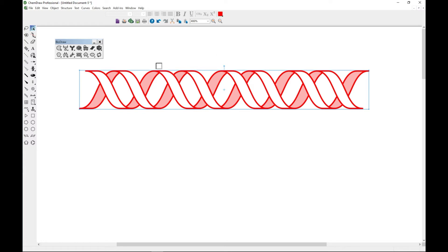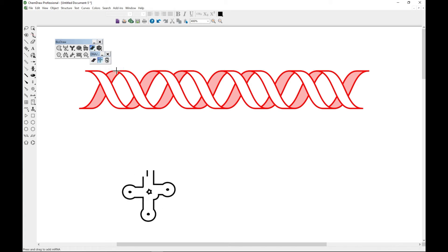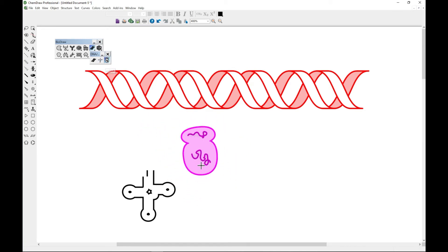From the DNA toolbar you can tear this down. You can also draw tRNA as well, and you can also draw mRNAs as well. That is very important to note.